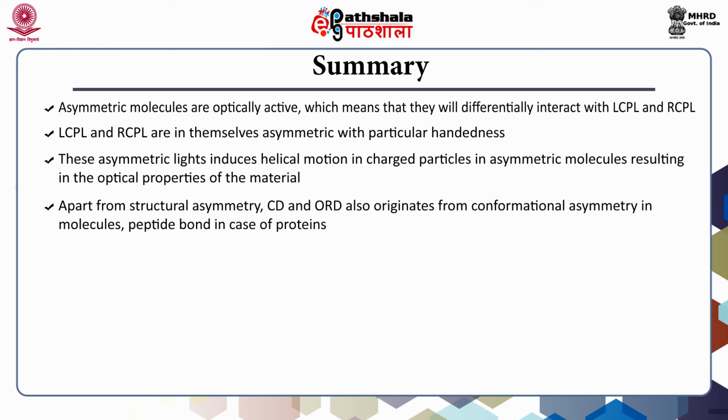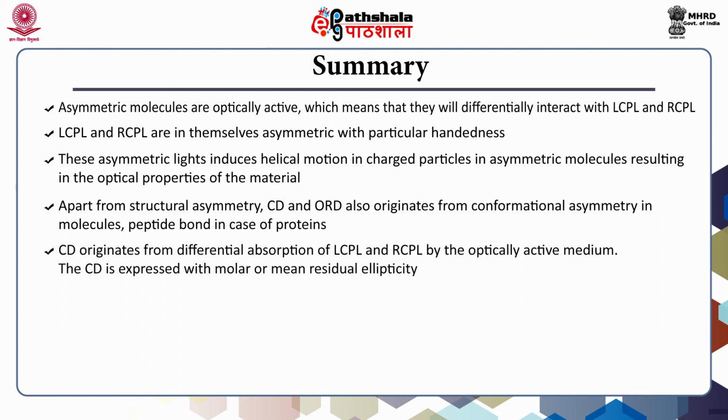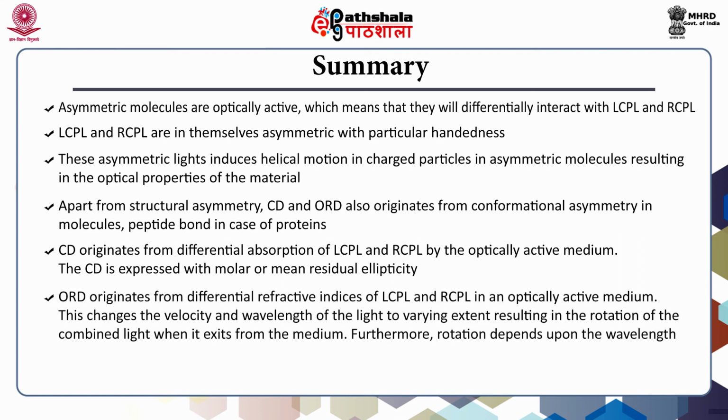Apart from structural asymmetry, CD and ORD also originate from conformational asymmetry in a molecule, such as peptide bonds in the case of proteins. CD originates from differential absorption of LCPL and RCPL by the optically active medium, and is expressed with molar or mean residue ellipticity. ORD originates from differential refractive indices of LCPL and RCPL in an optically active medium.